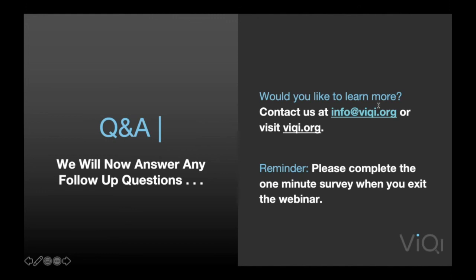Well, so I showed you this feature table, right? So that's just the regular table. It's like a spreadsheet. It is a spreadsheet. And so feature-based AIs, once they digest the image content down to numbers, right? Well, you can insert any columns that you want with numbers that describe your samples in some way that hasn't been extracted from the image. And then you just feed the whole table into the AI. And in fact, the AI will give you feedback on which columns were more important based on these feature selection algorithms, right? It'll tell you whether the column that you added that had whatever numerical content actually was selected in the AI and how big of a role it played compared to the others.